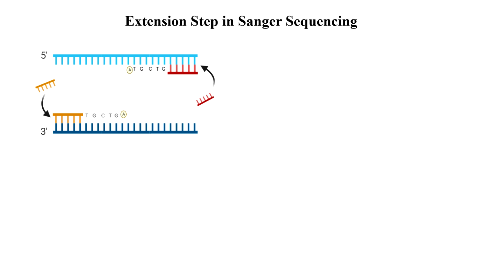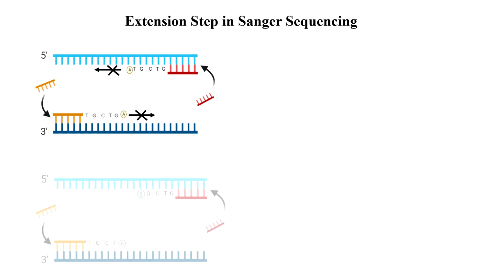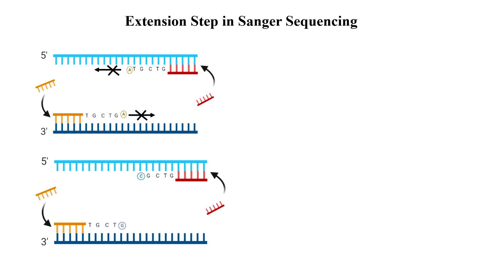All these dideoxynucleotides have a unique fluorophore attached to them. In the extension step, whenever dNTPs enter, further extension occurs. But when ddNTPs join, the reaction terminates.